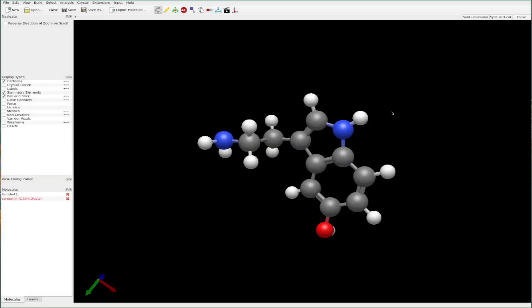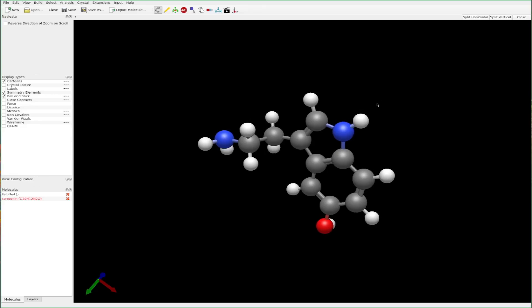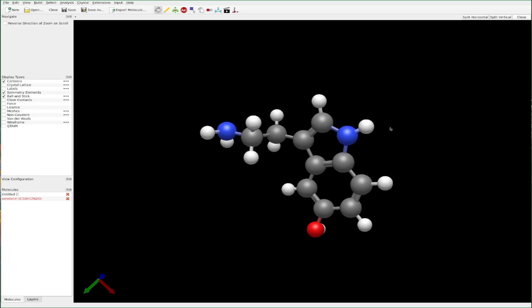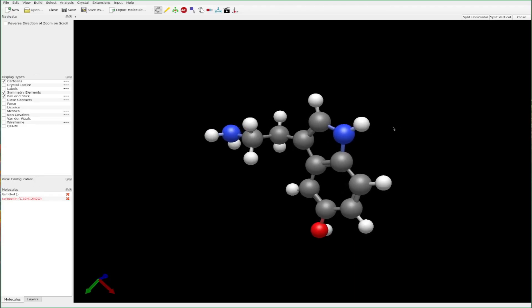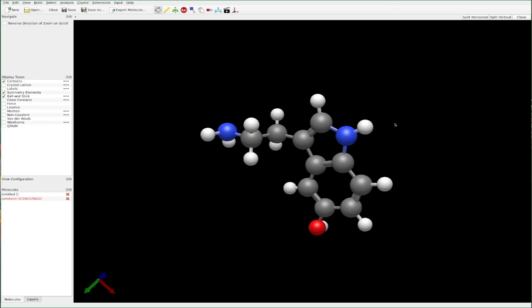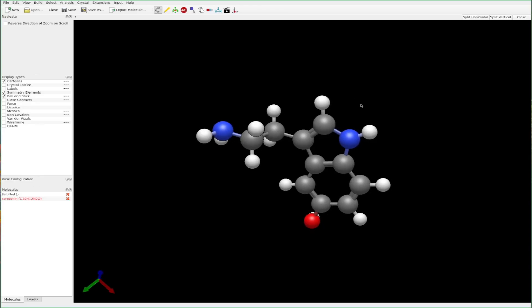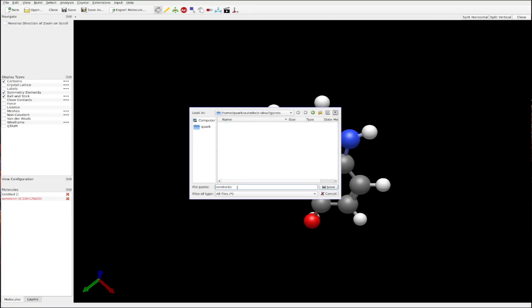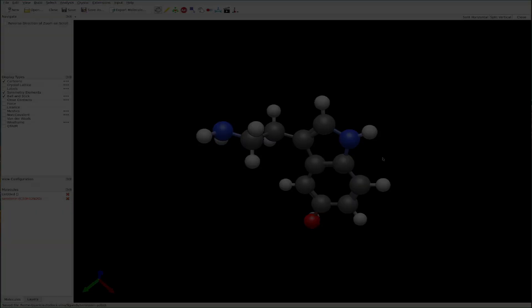Now we'll need to obtain the PDBQT file for our ligand, which in this case is serotonin. This can be done in a variety of ways using almost any computational chemistry software — for example, GaussView, IQmol, or as I'm showing here, Avogadro. Suppose serotonin was some novel molecule and we wanted to see if it fit into the 5-HT2A receptor — we would first optimize it using some DFT method to get the optimized structure, then open the file in Avogadro, go to File > Export Molecule, and save it as serotonin.pdbqt.